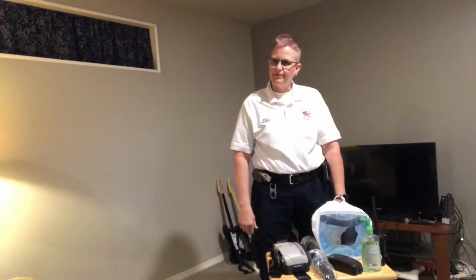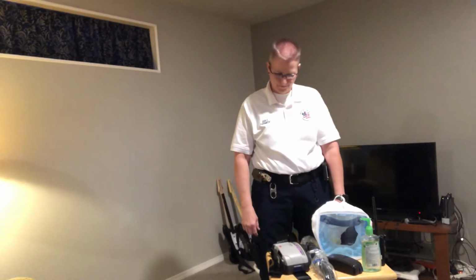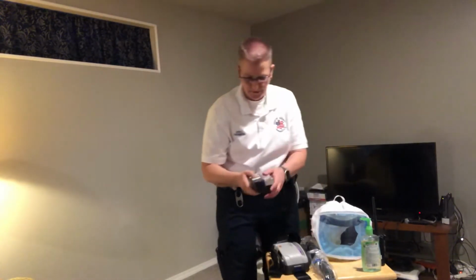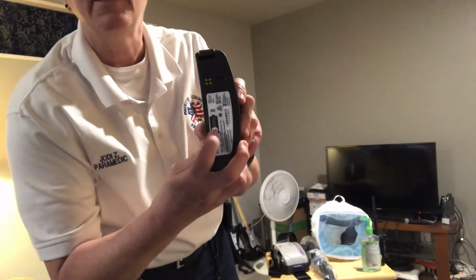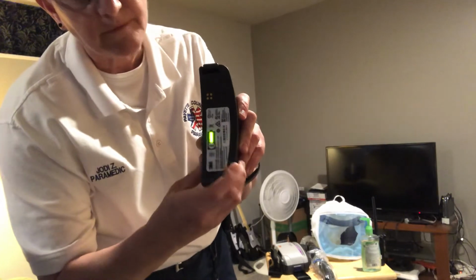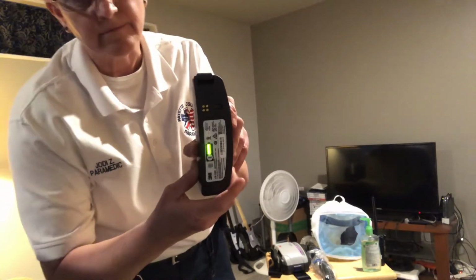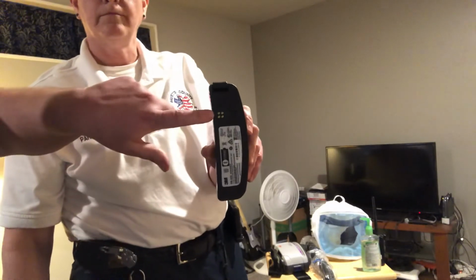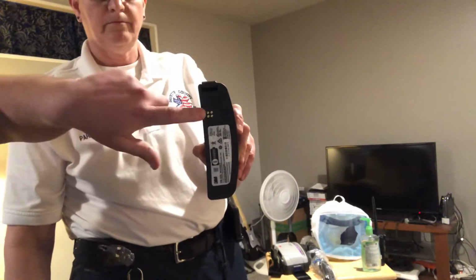Secondly, Jody is going to test the batteries. We only have one, but we're going to check the one battery that we do have, if you push that button right there, which we did earlier. It's on the underside. Now, I've also, just to point out about the battery, these contacts right here.